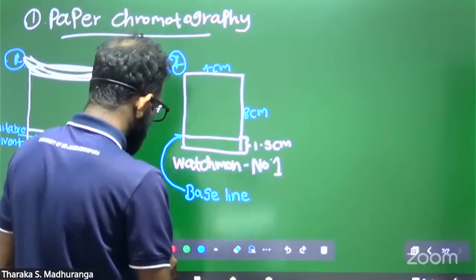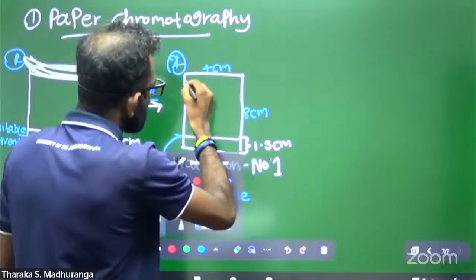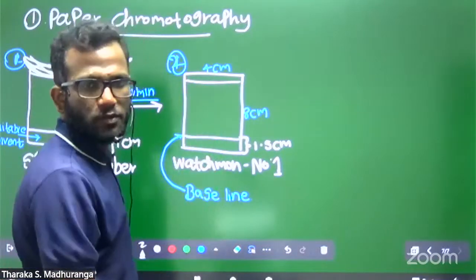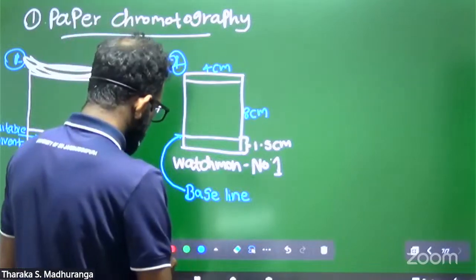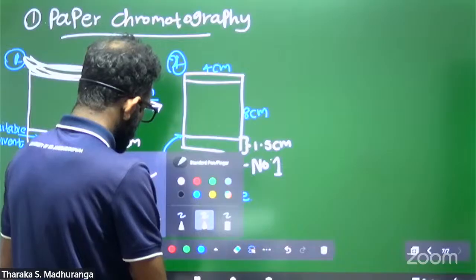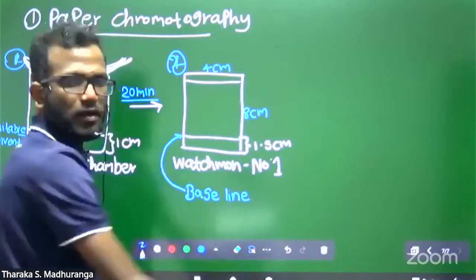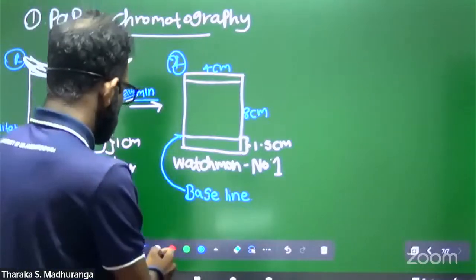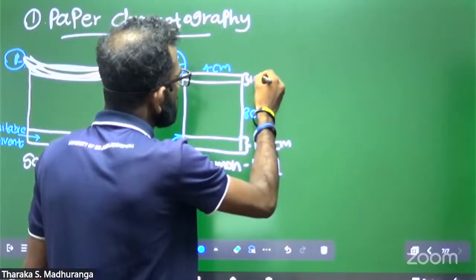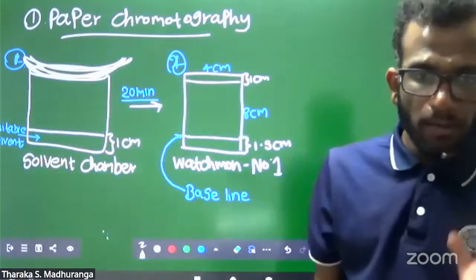It should be a thin, straight line, 1 centimeter below the upper end.